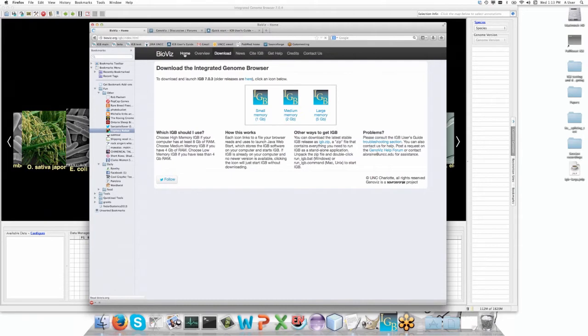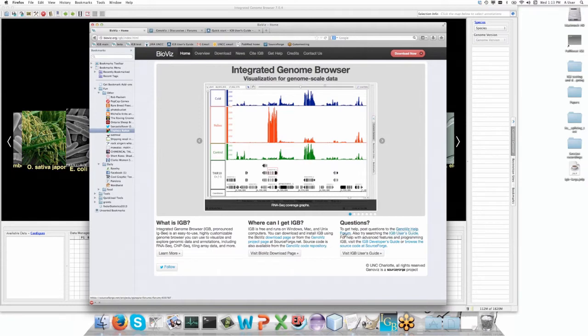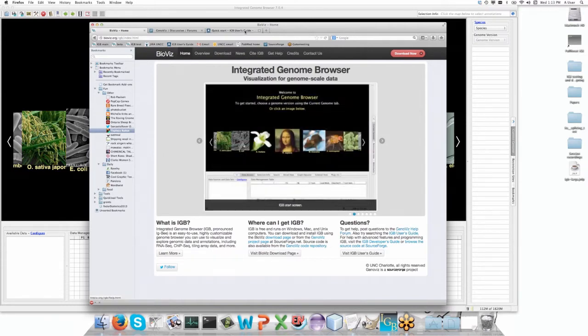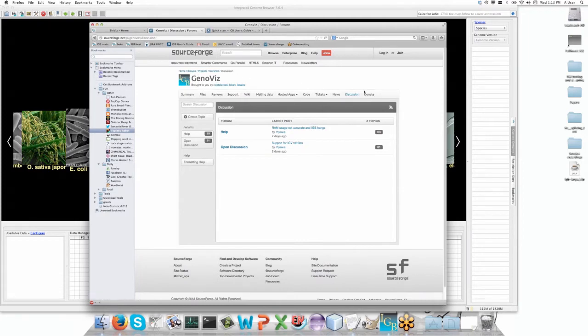Additionally, on the home page you can get access to the user's guide or the help forum. The help forum looks like this - it's SourceForge for the Genoviz project. If you go to discussion, you can see there's a help forum and an open discussion forum.